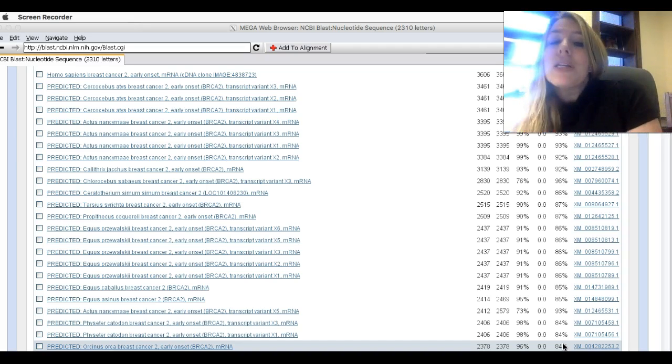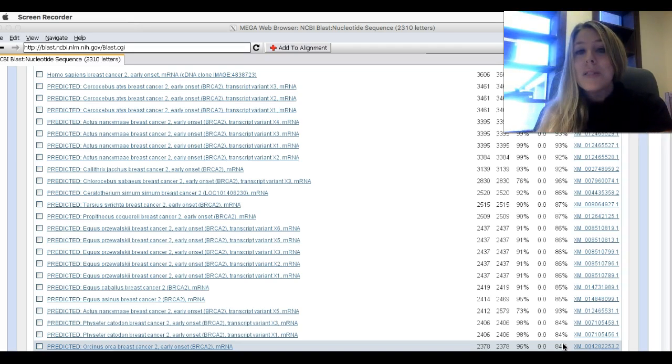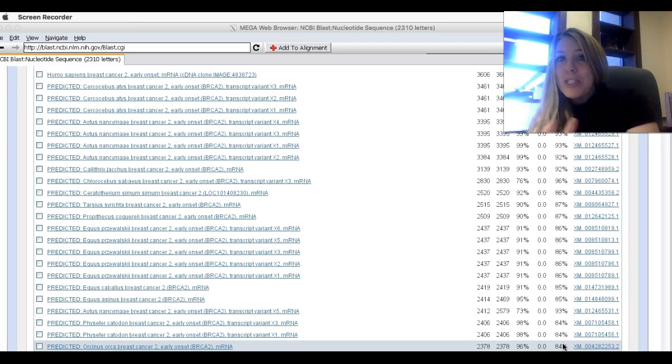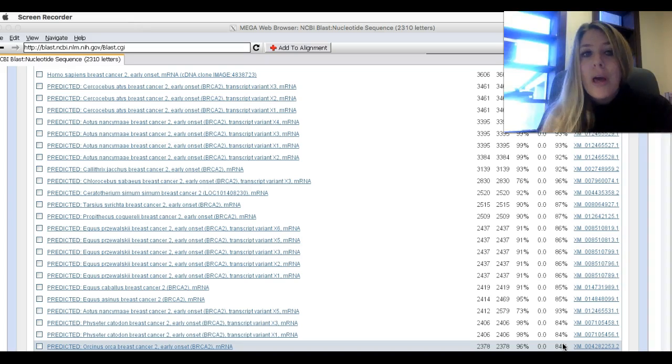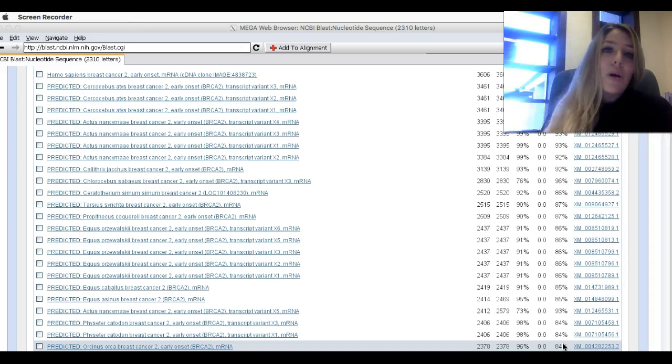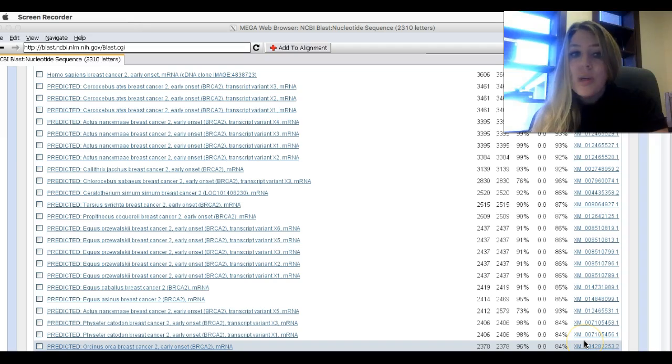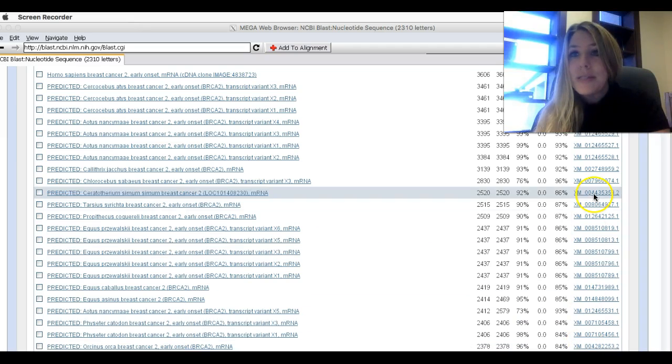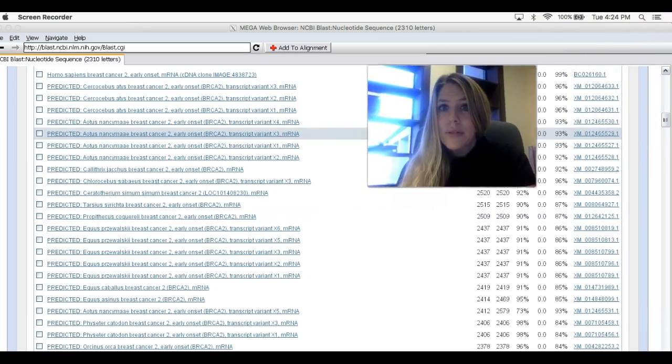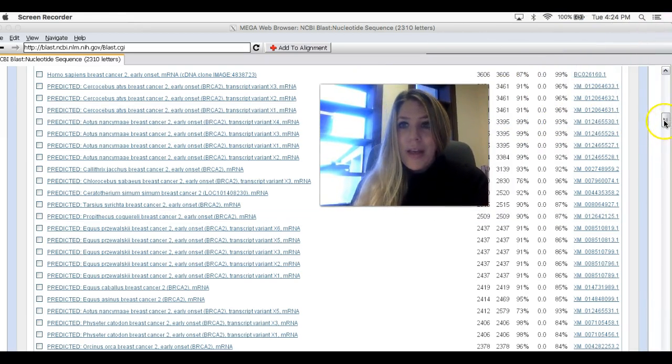What we're going to do is we're going to start downloading these DNA sequences for about eight species or so. You could do more. You don't want to do a lot less because you won't get a good tree. So I'm going to show you how this is done. I'm going to move my head somewhere out of the way. I'll move me right in the middle for now.